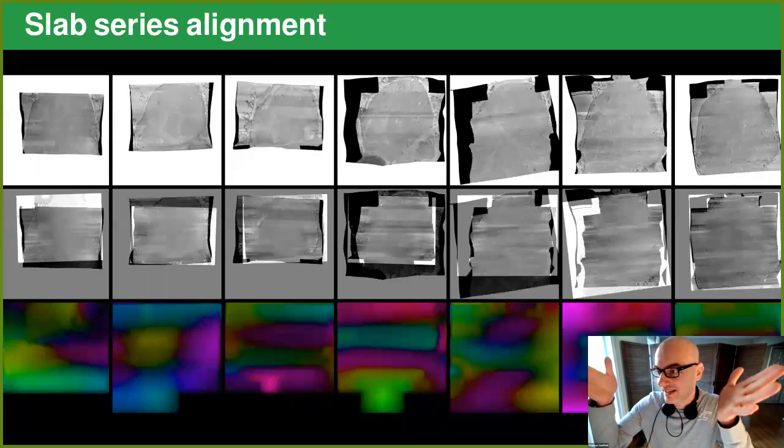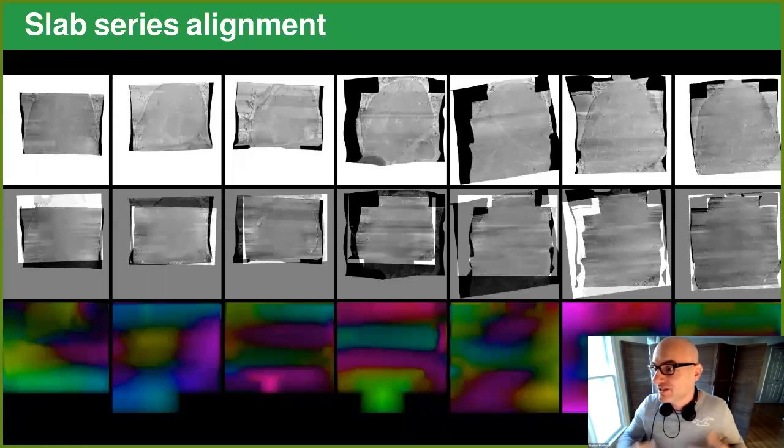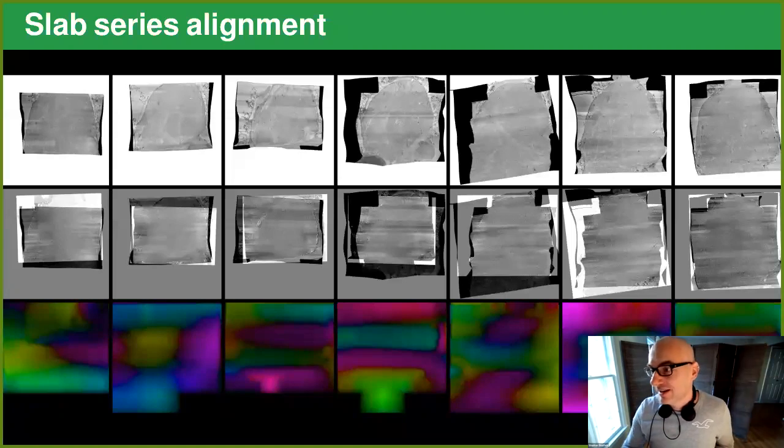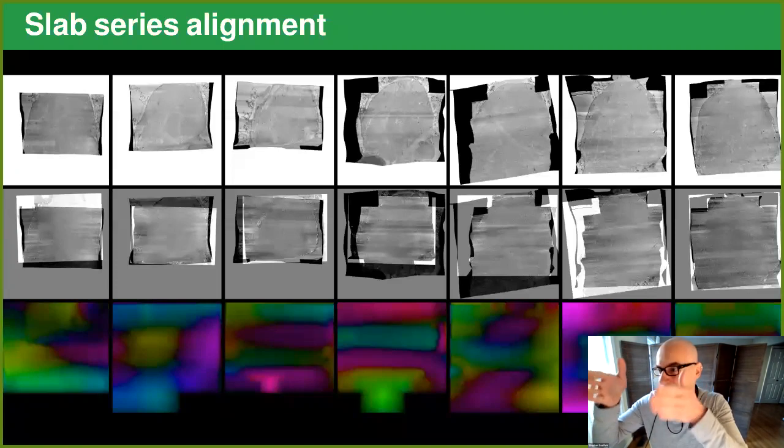And then each block size comes in with its own hypothesis about the flow field, and now we can compare these scales and look where they disagree. So what their consensus set for the flow vector is, we use that as the flow vector at this position. And this can come from block sizes of random sizes. What you would usually get for very small block sizes is that things get super noisy, and for very large, and then comes kind of a stable region.